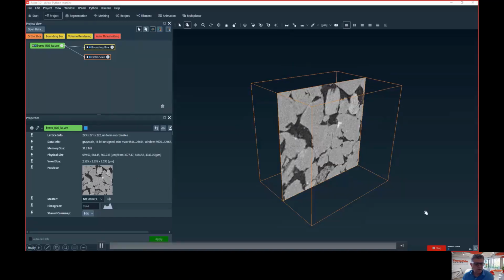Yeah, so the idea is that you start already in a project with data and so on, and you want to start experimenting with Python. It's the first time, you never saw it. So in Avizo, you know Python, but what you probably miss is how to exchange data between Python libraries and Avizo objects. If you come here doing Python stuff, it's because you already think that you have some science, some code, some idea that could be done better in Python.